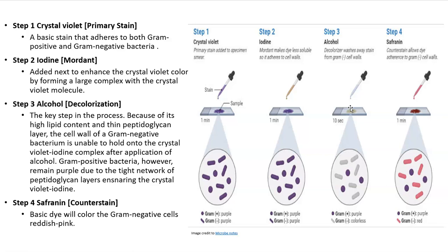In my lab, I prefer to hold the slide at an angle and add 1 drop of alcohol at a time and watch the dye run down the slide. When the dye starts to run off the other end of the slide clear, then we stop adding alcohol and rinse with water. There are several ways that you can do it, but regardless of the exact method, alcohol would need to be added to the slide.